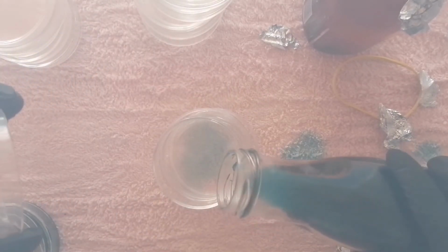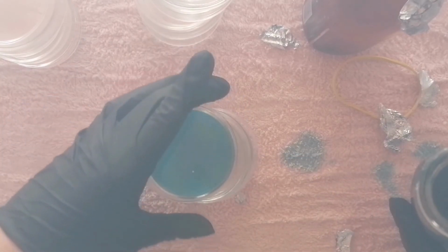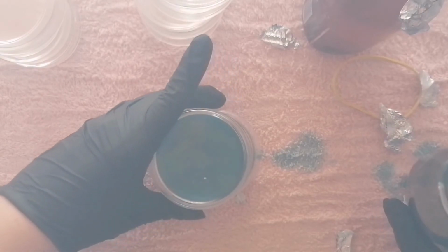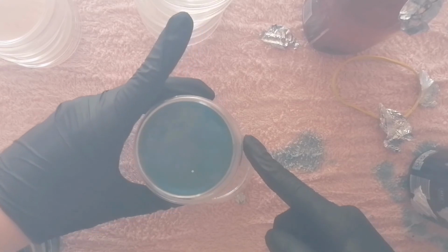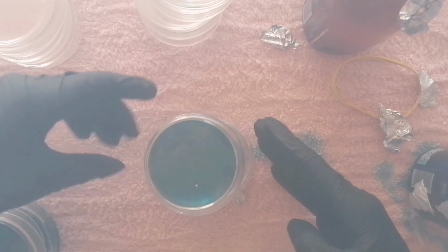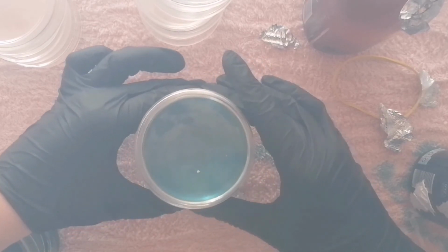Okay, so now the second stack of petri dishes. So here I use the right method where you take the lid. Oh, see, now I think. So now you take the lid of the petri dish below, you pour in your agar, you place the stack, take the lid below, just make sure they don't fall. And this is why I only stack about 5 because the glass is heavy and slippery and I don't want to mess the agar on me because it is still quite hot because it is still liquid. So yes, and then I repeat this with the 4 stacks.